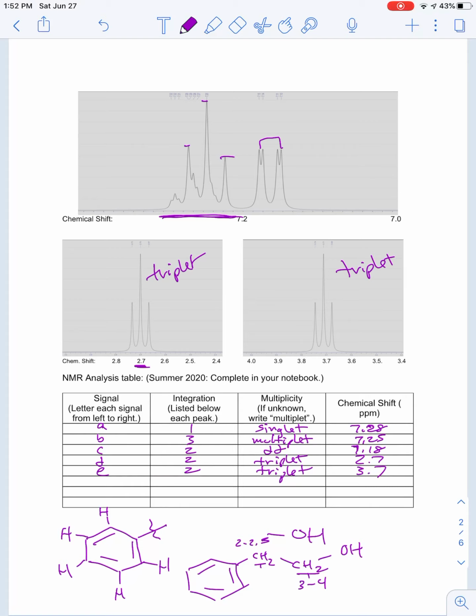Because we don't have a significant electron withdrawing or electron donating group here, these 5 protons are going to be very similar. They might really be on top of each other. So as long as you have a total of 5, you're likely going to have an aromatic ring like this. In the real proton NMR, I think these will be the ones that are slightly upfield.